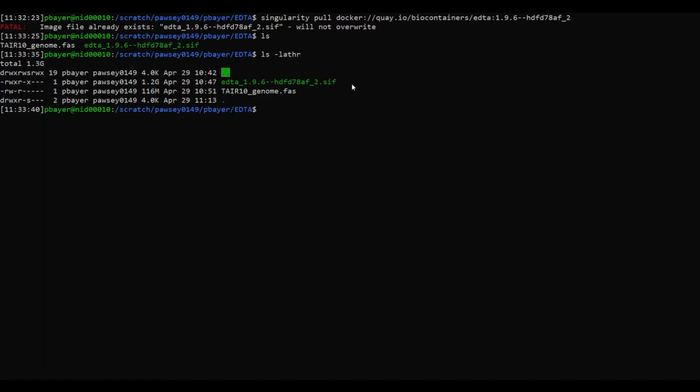So the solution for that is overlay file systems. You put everything into this single file. To the HPC system, it's just a file, but to Singularity, it's a file containing millions of files. So this is how you make the overlay file system using Singularity. I copy-pasted this from their manual.